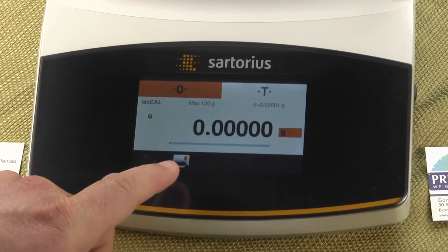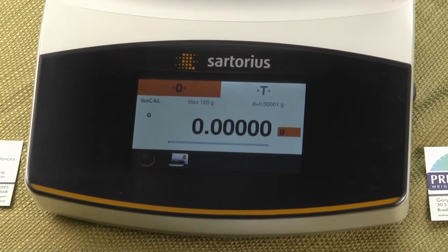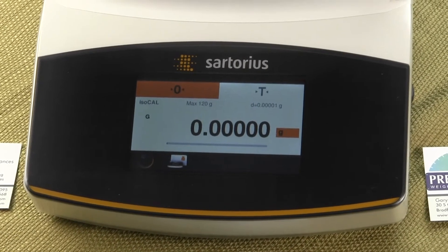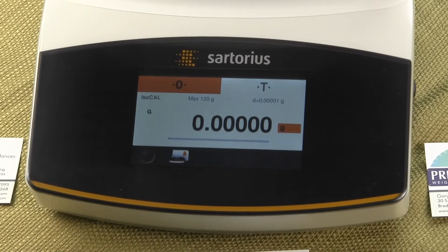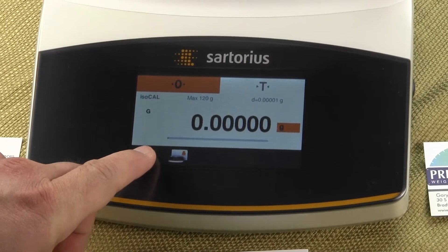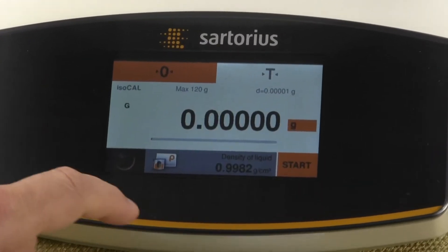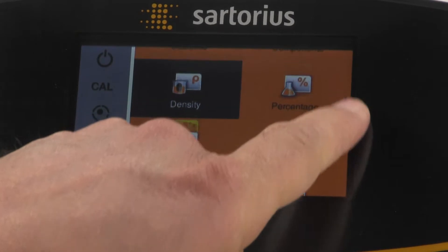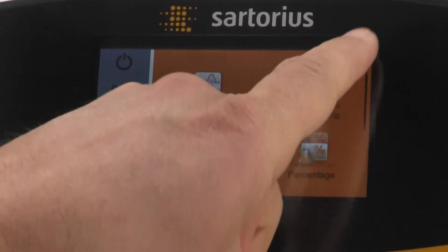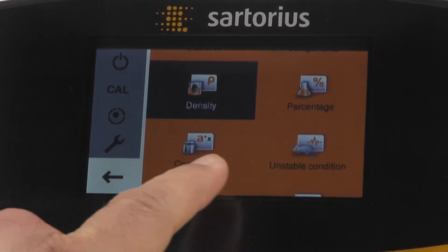The last weigh-in configuration is shown by this icon in the lower left-hand corner — that's the weigh icon. To get into changing one of the weigh-in applications, we're going to select the menu key in the very lower left-hand corner. These are all the weigh-in applications, and with this nice touch screen, you can just scroll up and down to see all the different weigh-in applications.